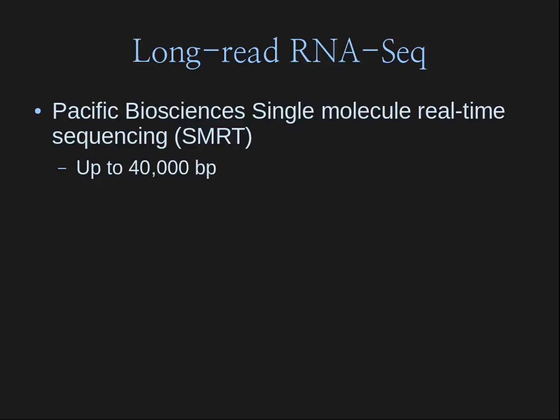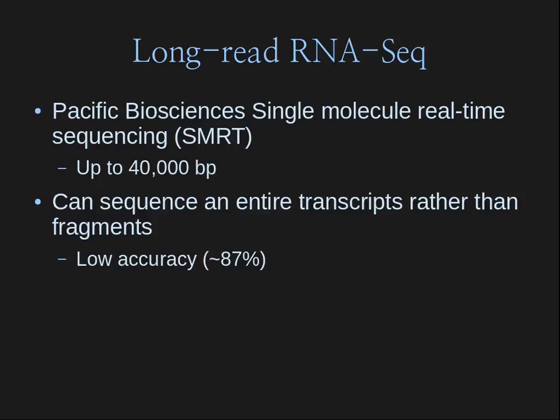So when you were assembling things, we're dealing with reads that are like 50 to 70, maybe more than 100 base pairs long, and then you have to spend all this computational time to assemble those. And then we have to do a lot more. If we're interested in isoforms, we have to jump through hoops to determine, based on all of these small individual reads, which isoforms are present and what quantities. If you can read the entire transcript, this opens up a whole new world of being able to do transcriptomics, much less computationally intensive.